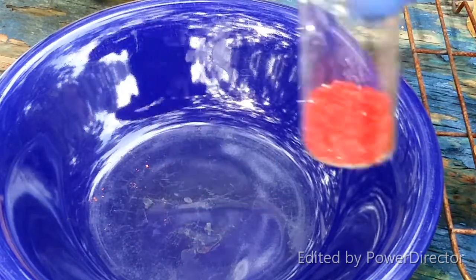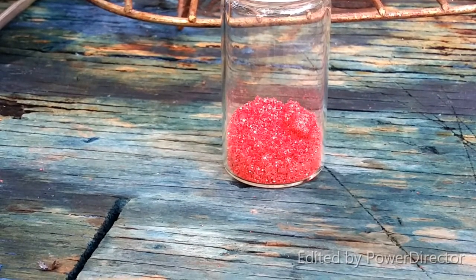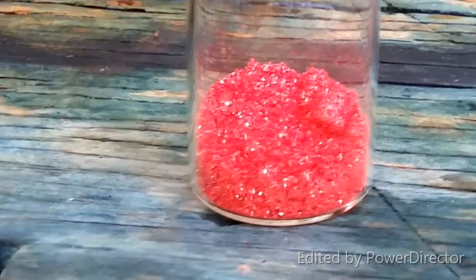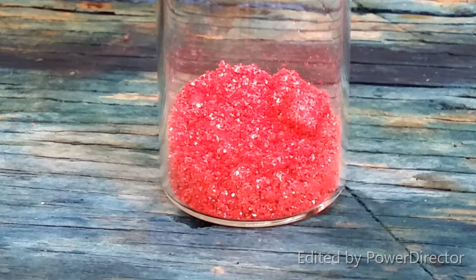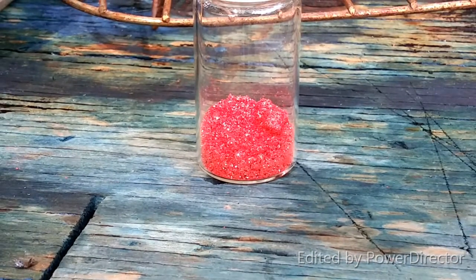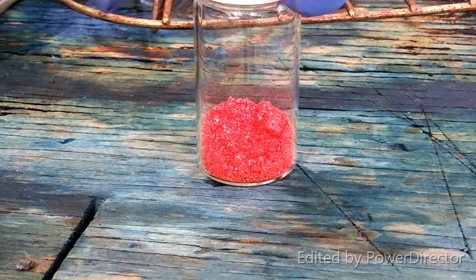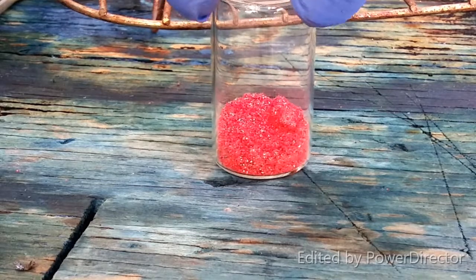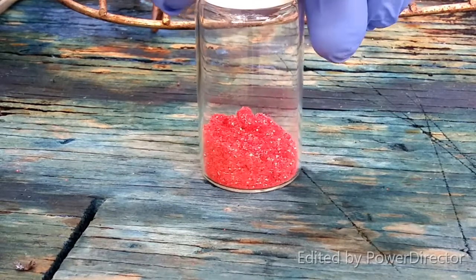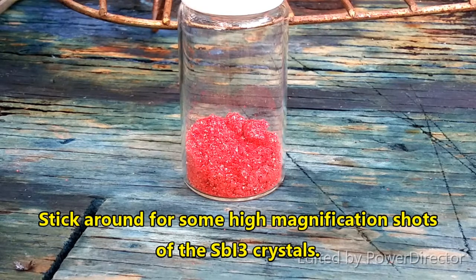Ta-da! Here, let's put it down here, you can see it better. Look at that! It sparkles, it's beautiful. It looks a lighter red on camera than it is in real life, though. That is a much more vivid red. It has kind of more of a rusty red color in real life. But for whatever reason, the camera sees this as a bright cherry red. That is cool as hell. Look at that. That is absolutely beautiful. So there you have it, people. Antimony triiodide. That's cool as hell.